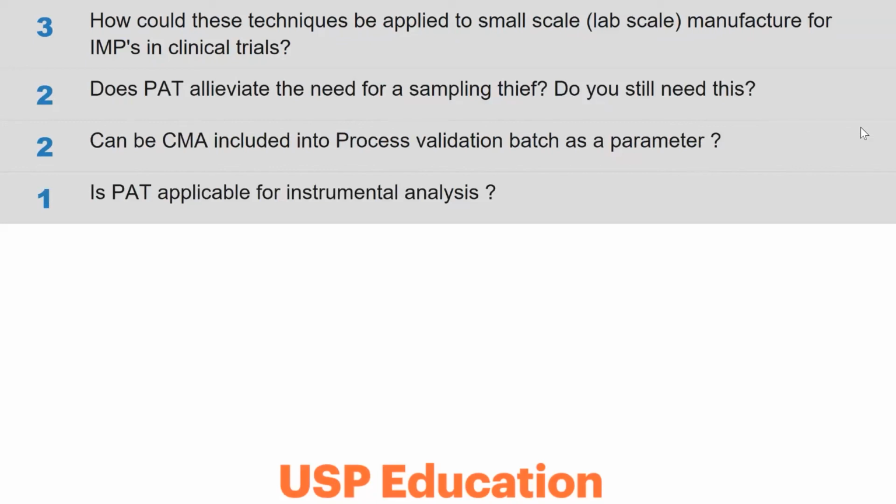That's throughout some sort of cross-sectional area. And what you need to do when you're qualifying your process analytical technology is you need to have a sampling port where you can manually take a sample at the same time that the process analytical tool is monitoring, to compare.